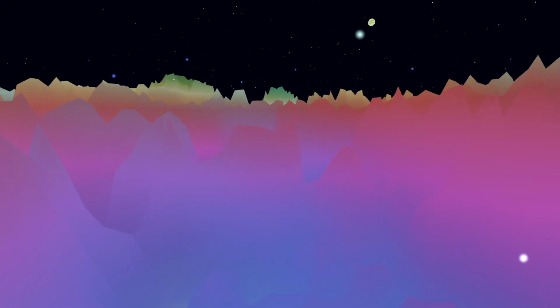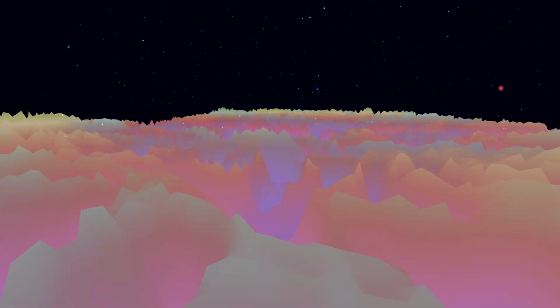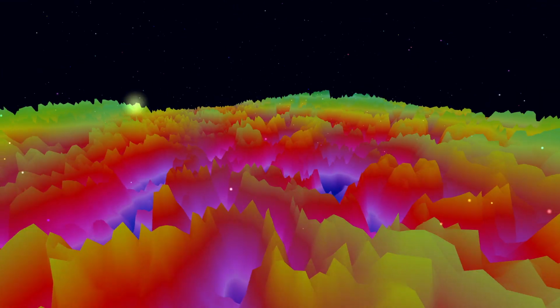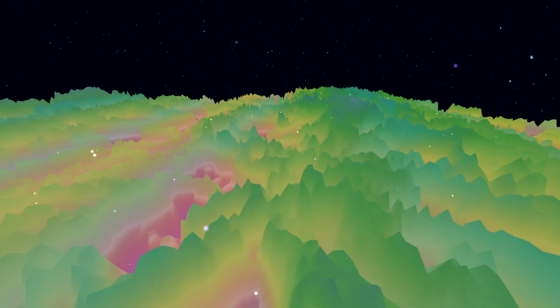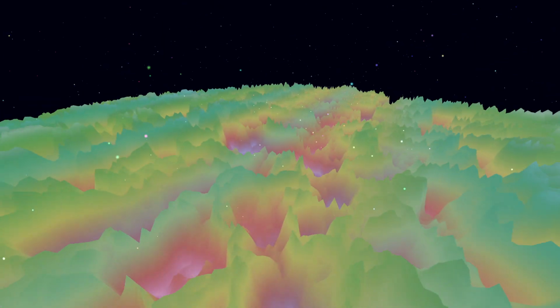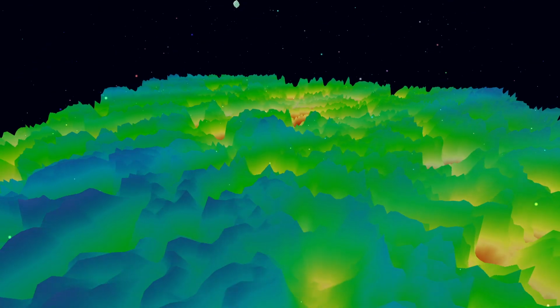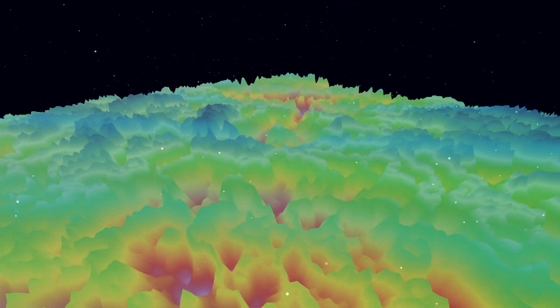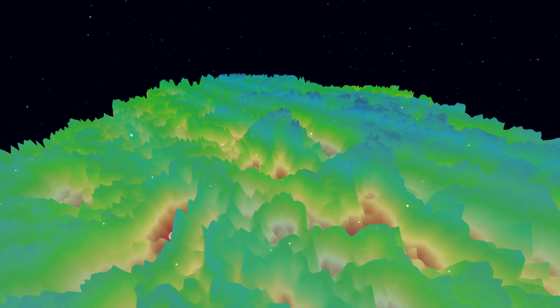Precisely. So UPS doesn't tell you much about elemental composition directly, but it gives you incredibly detailed information about the electronic structure of those valence electrons, what we call the valence band structure. It's crucial for understanding why a material behaves electronically the way it does. Is it a conductor, a semiconductor, an insulator? What are its optical properties? Yeah. UPS maps out the allowed energy levels for those crucial outer electrons. It's essential for studying semiconductors, metals, organic electronic materials.